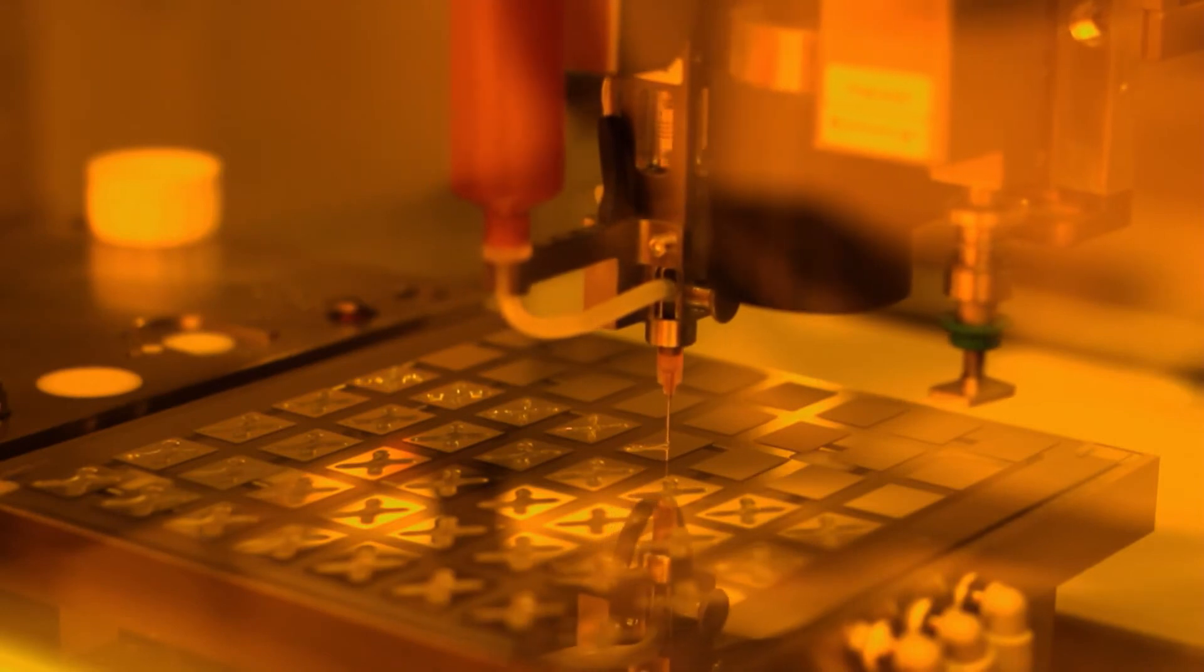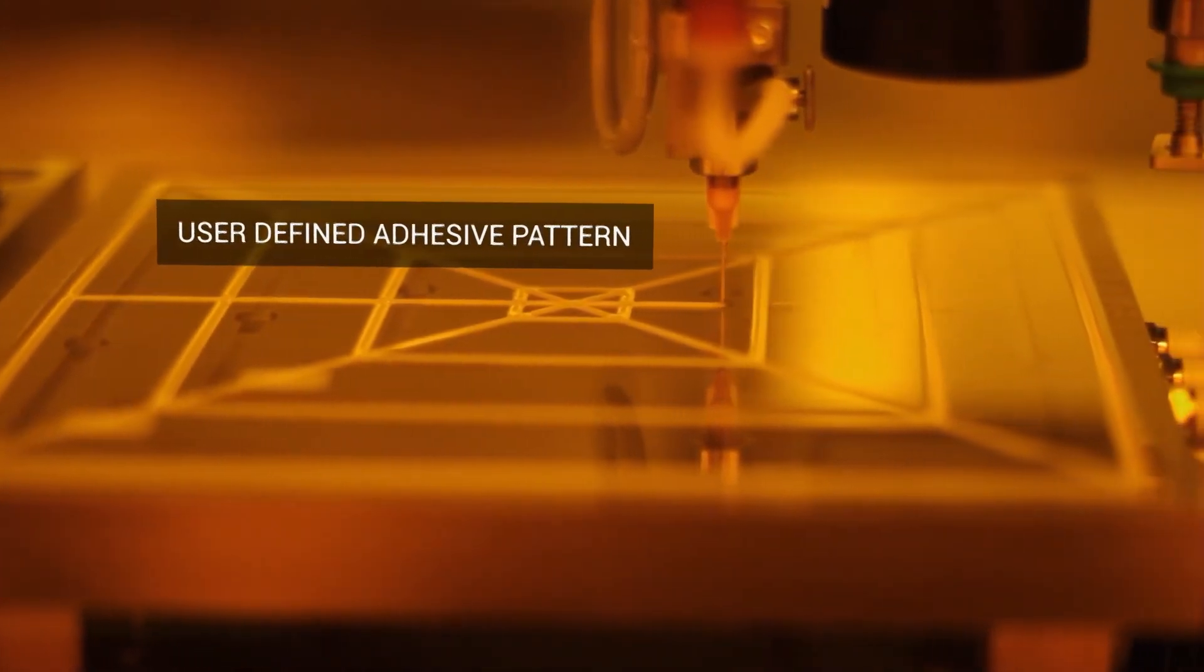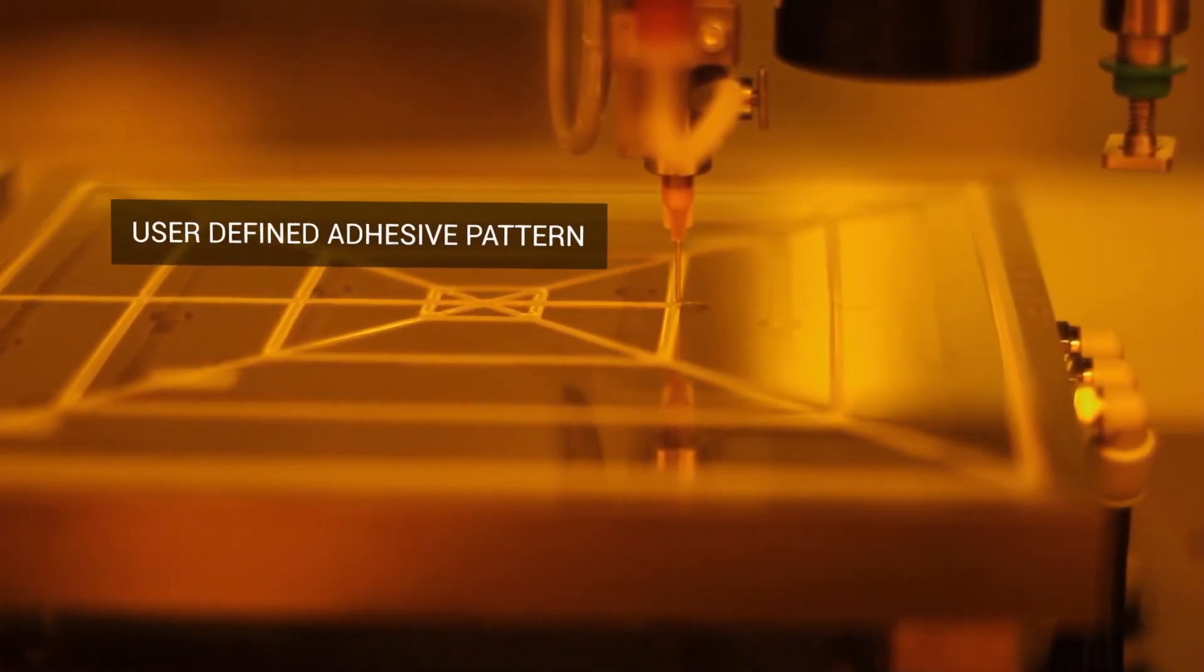Device performance and lifetime is enhanced by the use of an encapsulation module. Glue adhesive and getters are applied using a predefined recipe to the cavity glass. The device substrate and cavity glass substrates are transferred to a process module for sealing and curing of the glue.